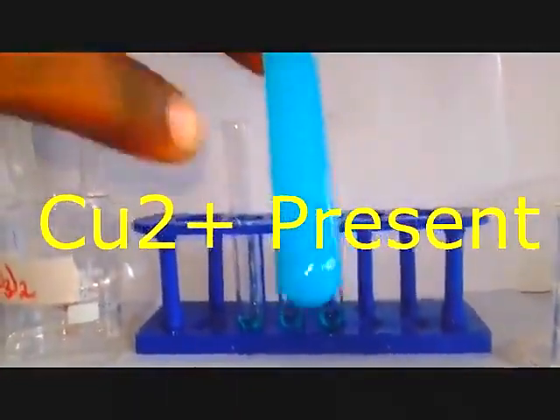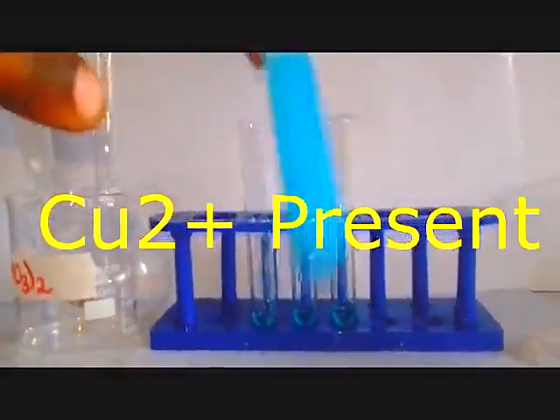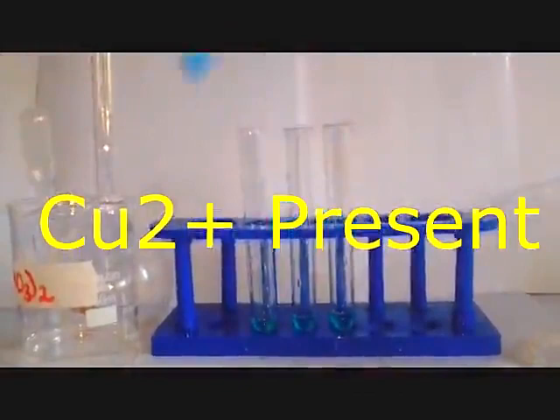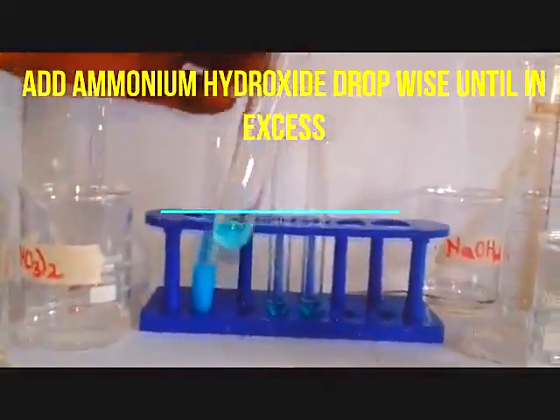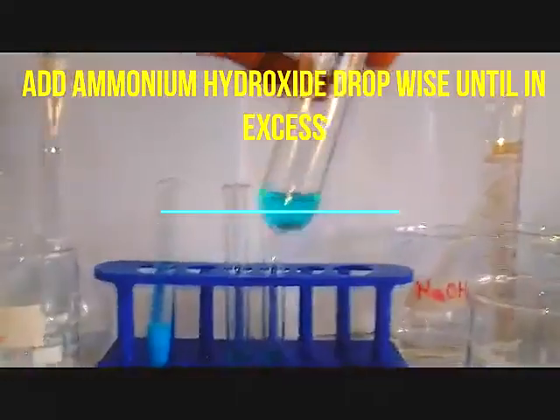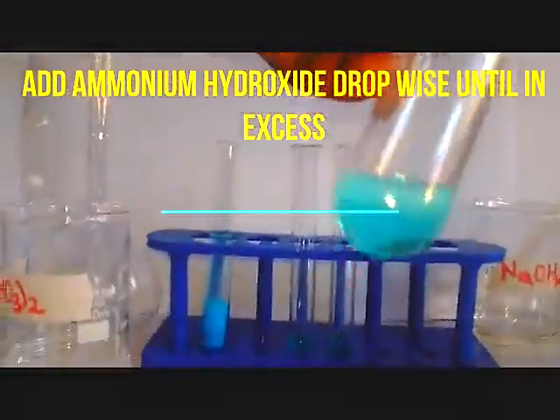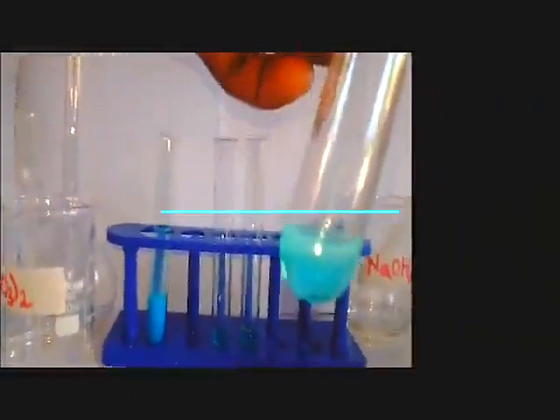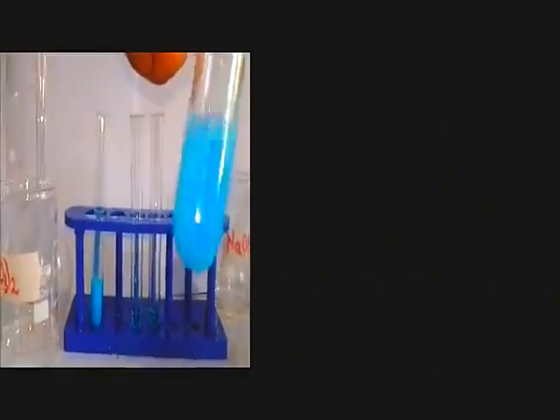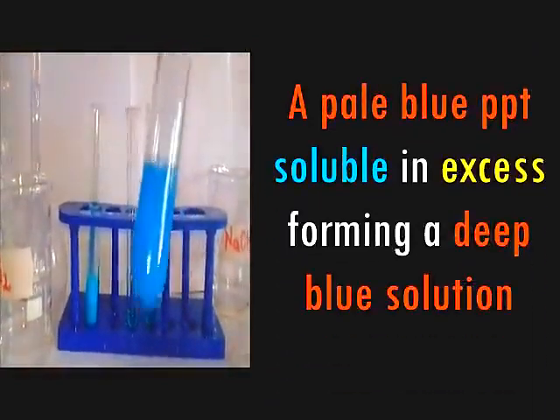However, we cannot confirm whether it's copper or not, because this is not a confirmatory test for copper. So let's put it aside. When you are adding aqueous ammonia, you should be able to observe what happens when you add the first drop. So the first drop, you are seeing a pale blue PPT. So we are going to add until in excess. We are seeing a certain deep blue color.